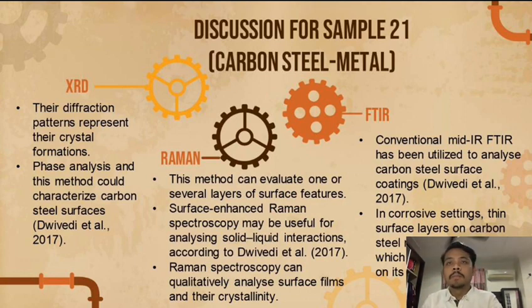Okay. Next, about Raman. Raman, for this method, can evaluate one or several layers of surface features. So this can analyze the metal plate. Next, surface enhanced Raman spectroscopy may be useful for analyzing solid liquid interaction according to the article. And then Raman spectroscopy can qualitatively analyze surface films and their crystallinity.